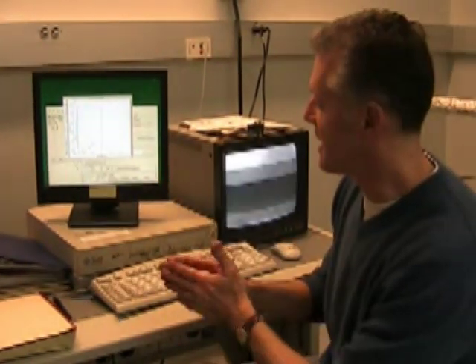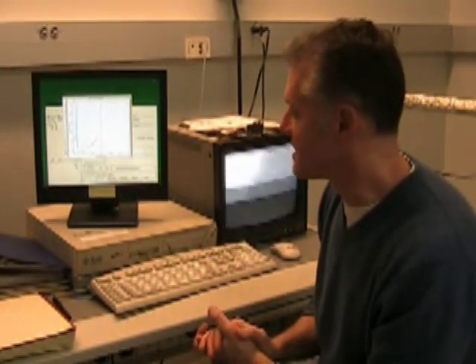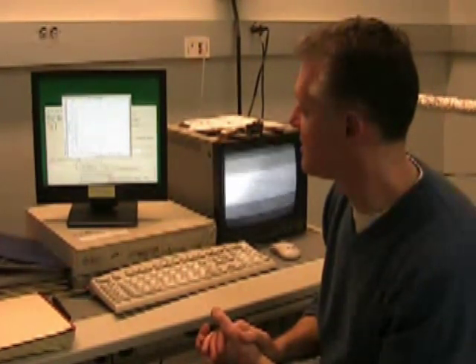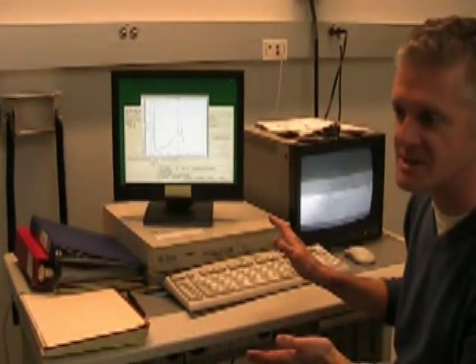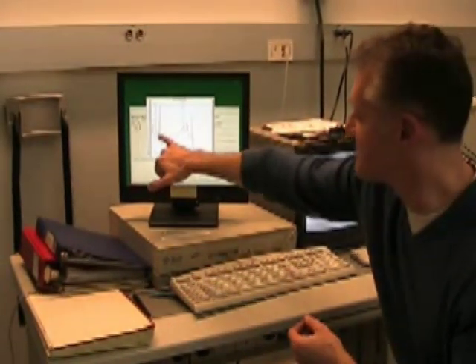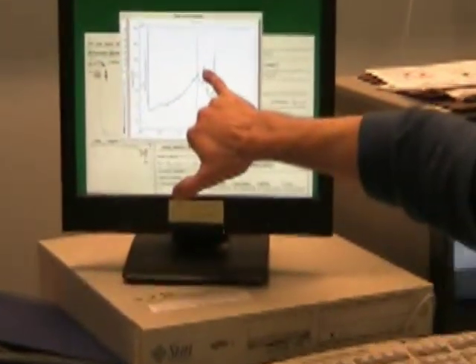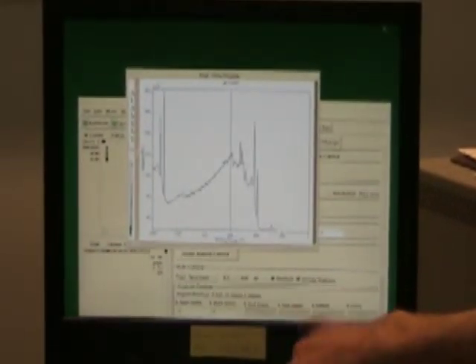So what this machine is doing right now is called a survey scan or a broad scan, and we're looking basically at the entire spectral width. That allows us to scan and see basically any element in the periodic table. We're just using a broad scan here just so that we make sure we see every element that is in the sample and how much of it is there. We're seeing some gallium peaks here, some more gallium Auger peaks here.